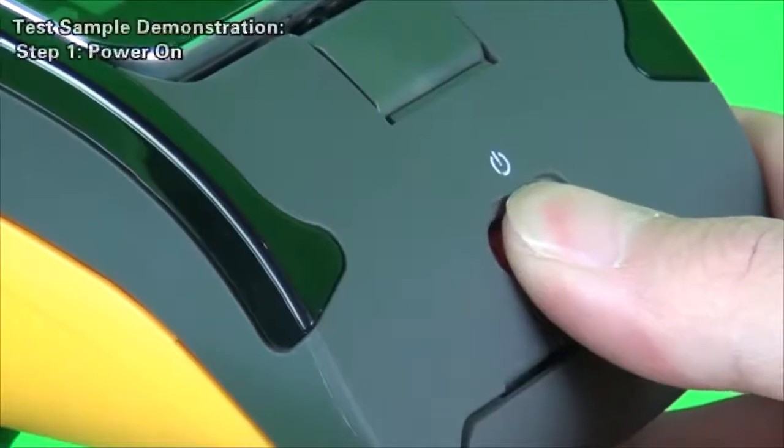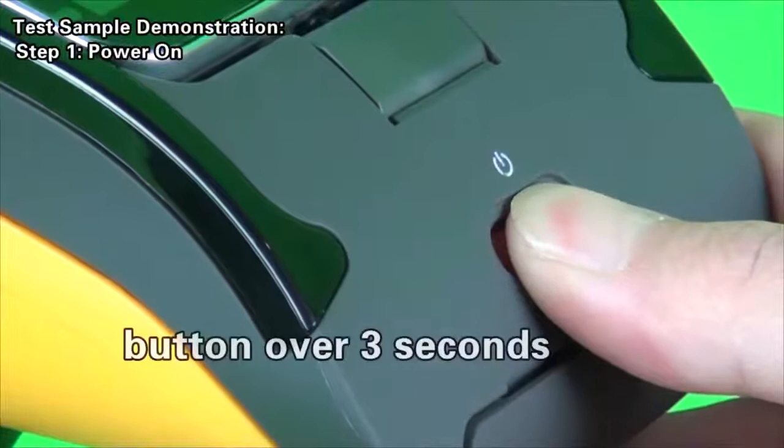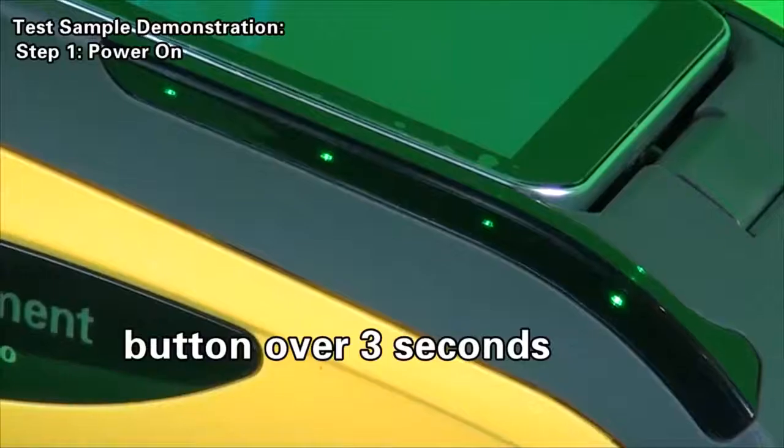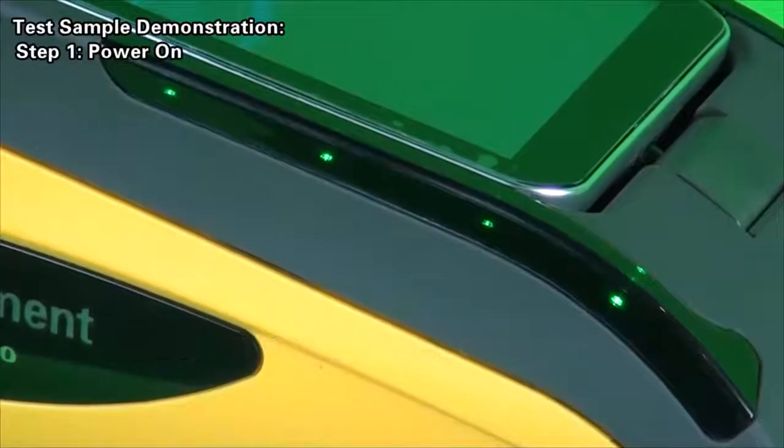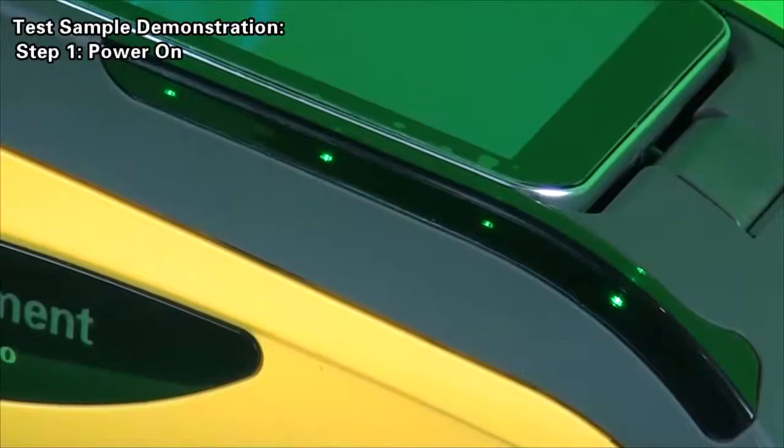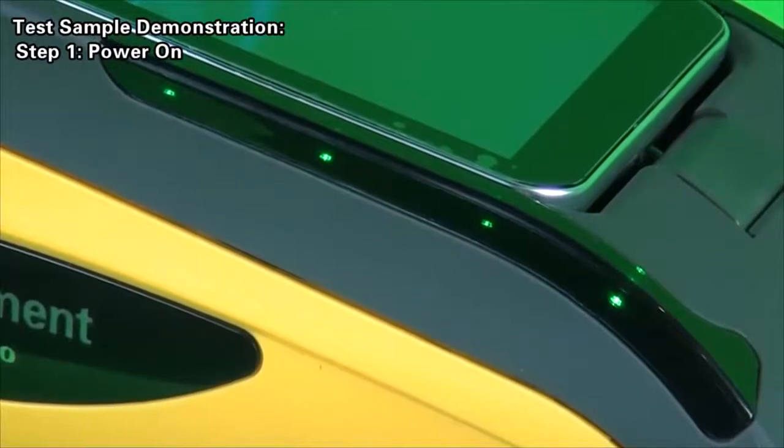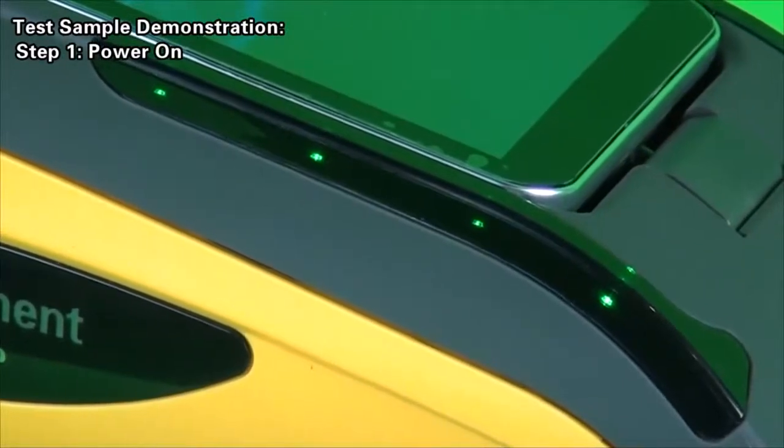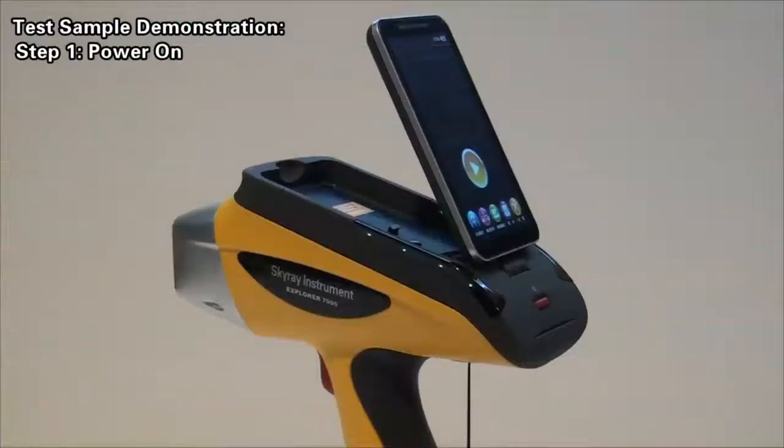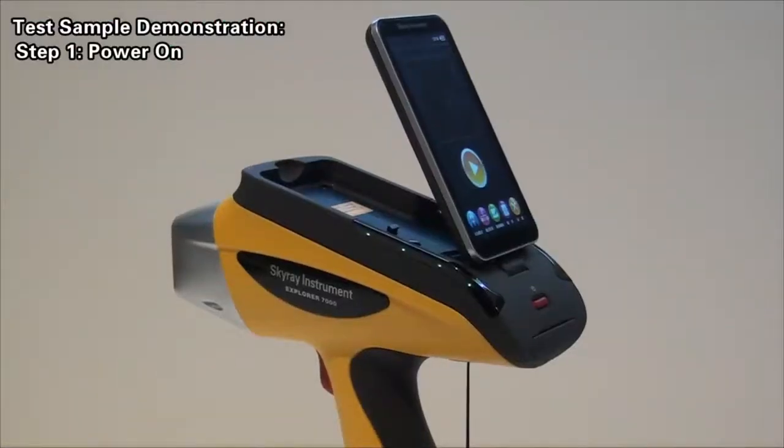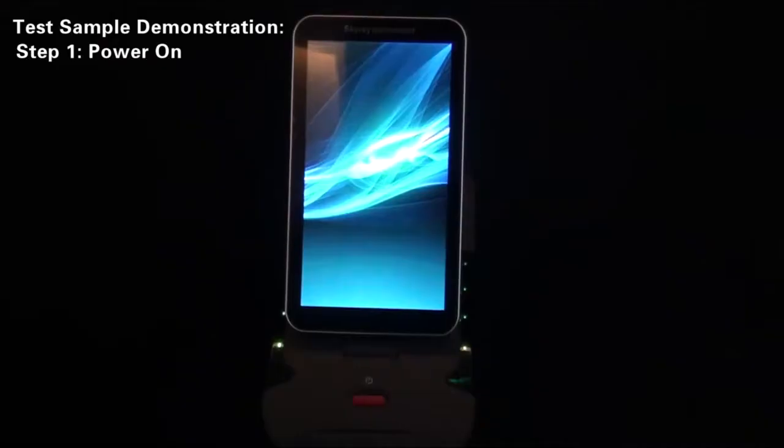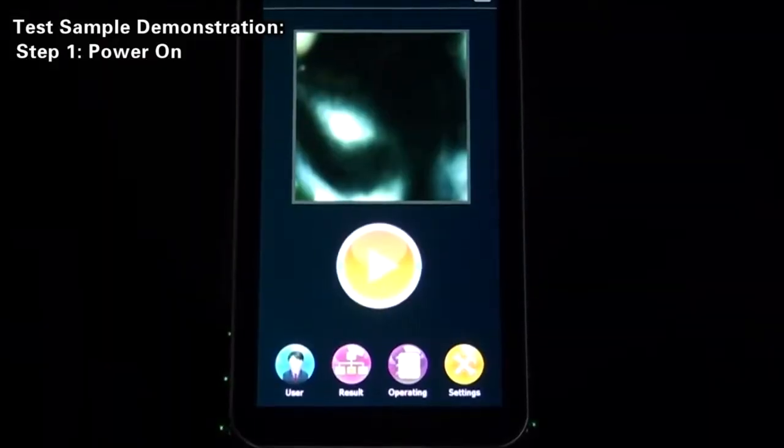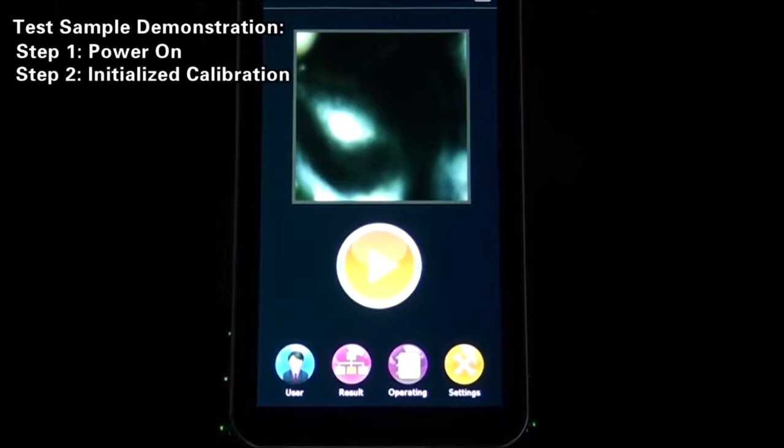Test sample demonstration, Step 1: Power on. For handheld instrument, keep pressing the power on button over 3 seconds so that the power light flashes green. At this moment, system boot will be seen and the software will automatically enter the main interface in use mode. This process will last for about 60 seconds.